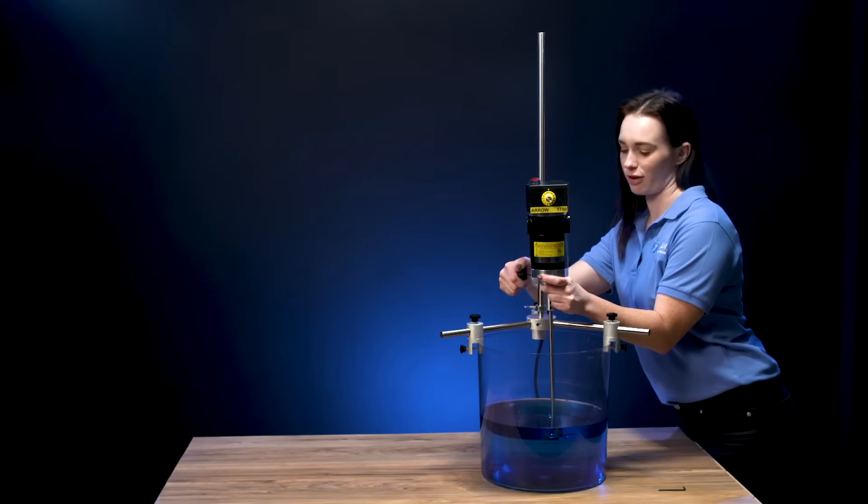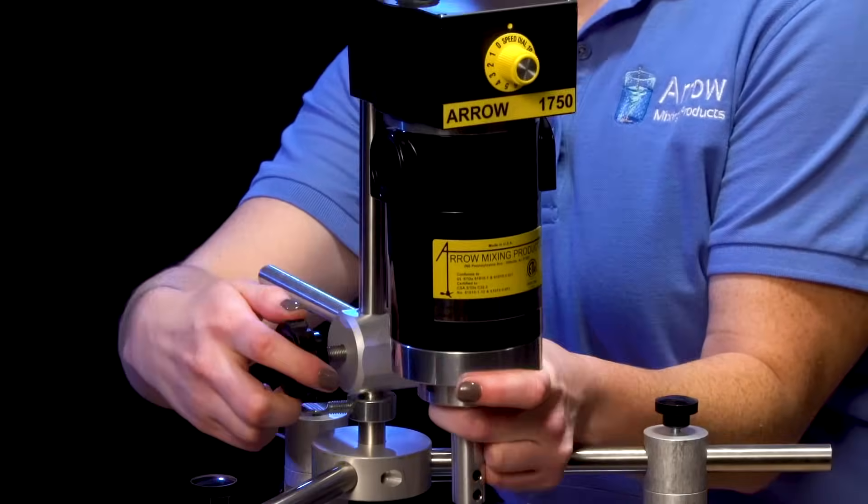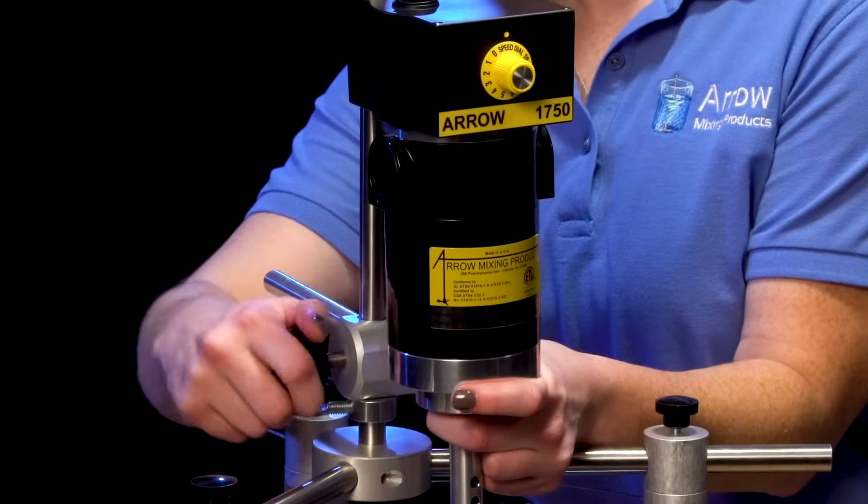Slide the clamp and stirrer down the center rod. Secure the clamp and stirrer.